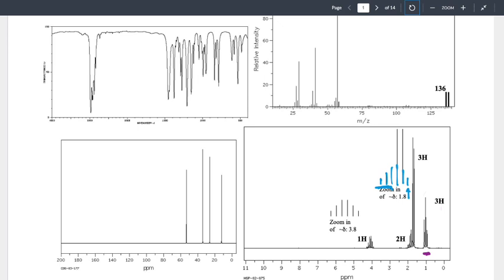Okay. Let's do the very first one. I have H bonded to question mark. Is it a question mark anymore? Why not? It has neighbors. If it was oxygen or nitrogen, I wouldn't see any neighbors, which means that hydrogen must be bonded to carbon now. I don't get a choice. This is nice because I get corroborating evidence. The molecular formula and the NMR are suggesting that that's carbon. That's good. I like that.